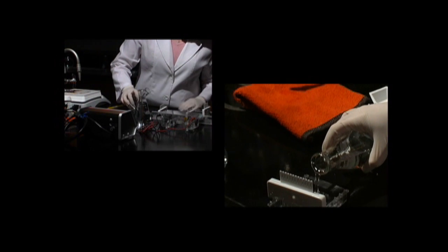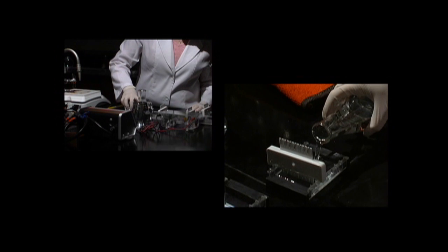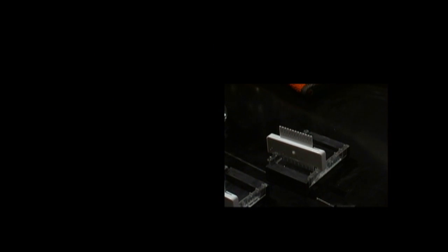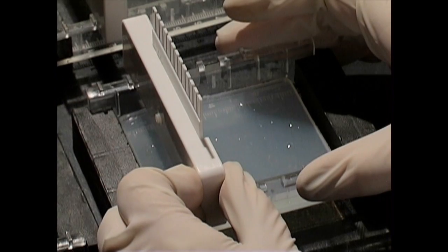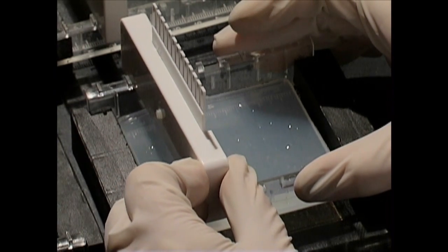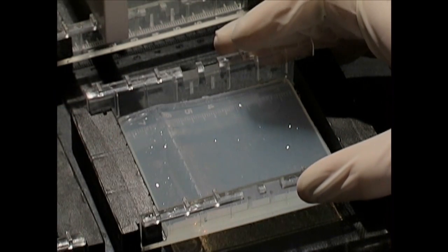Make sure it's on a level surface, and pour the agar solution into it. Allow 20 minutes for it to solidify. It should be firm and cool to the touch. Once the gel is solidified, carefully and slowly remove the rubber dams and comb.